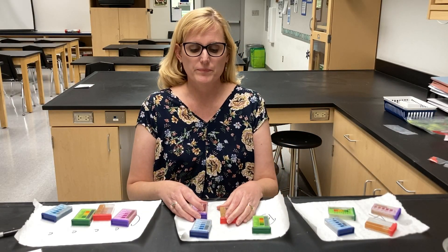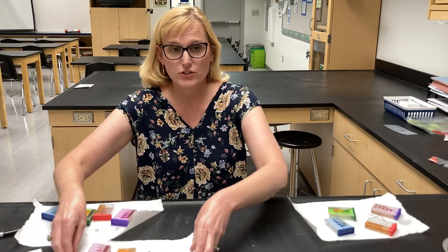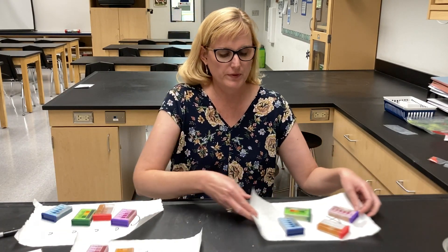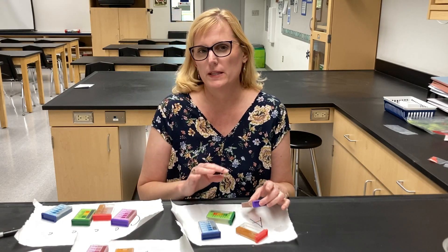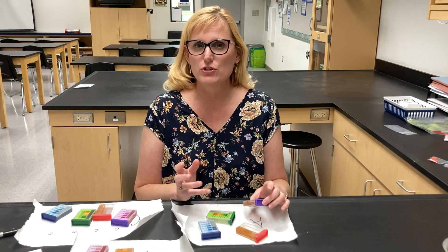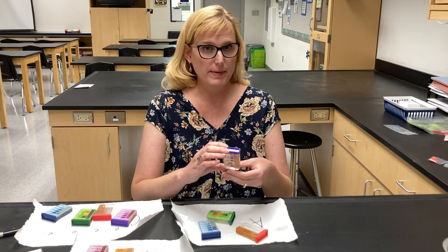Let's take a look at our results now. I'm going to hold up and analyze each of the three samples and we'll talk about it. You'll get some pictures but the color change doesn't come through great with the cameras, so I'm going to talk about them as well.